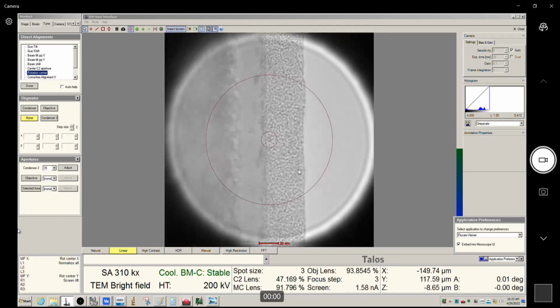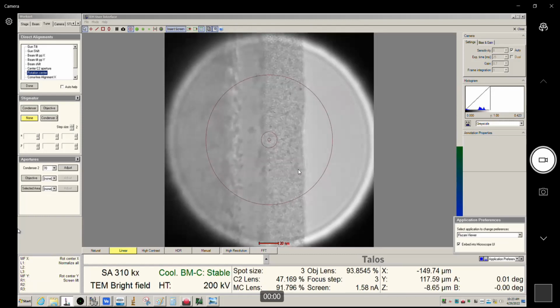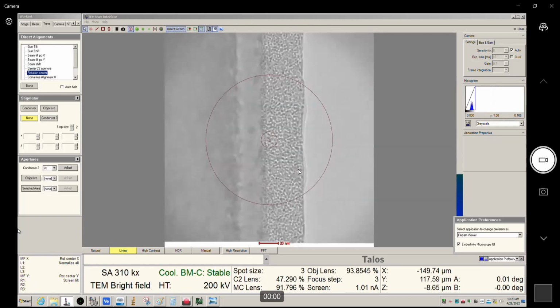Which brings me to the next point. I'm going to show you another way to do the rotation center alignment. The normal way is that I use my focus ring to turn off the pulsing of the lens. Then if I go clockwise, it turns it back on. I'm going to spread the beam out so it's outside the flu cam.